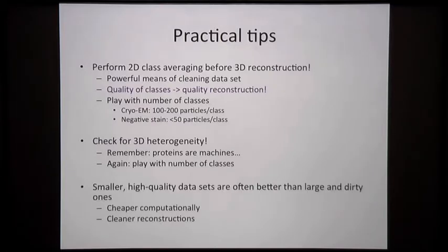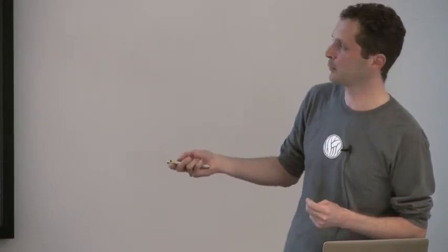And finally, some people are very keen on letting EPU run for 2 weeks and get 2 or 3 million particle images, okay? Now, we actually prefer smaller data sets which are of better quality, and it becomes computationally much cheaper. All these regularized likelihood optimizations aren't computationally cheap, so if you have to pipe through 3 million particles, that will take a while.